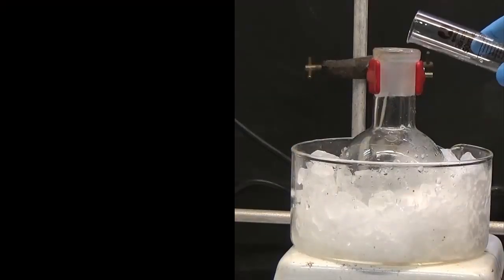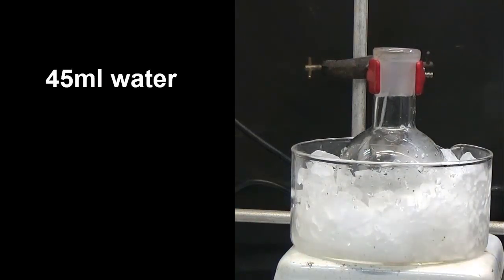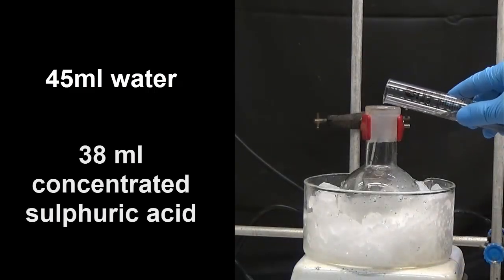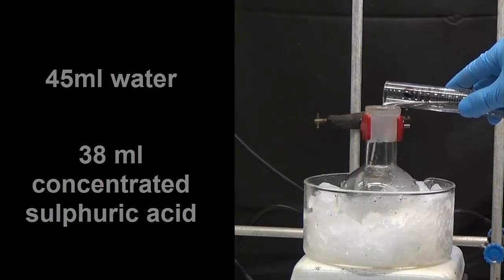In a 250 ml flask cooled with an ice bath, we place 45 ml of water. When it is very cold, add 38 ml concentrated sulfuric acid cautiously.